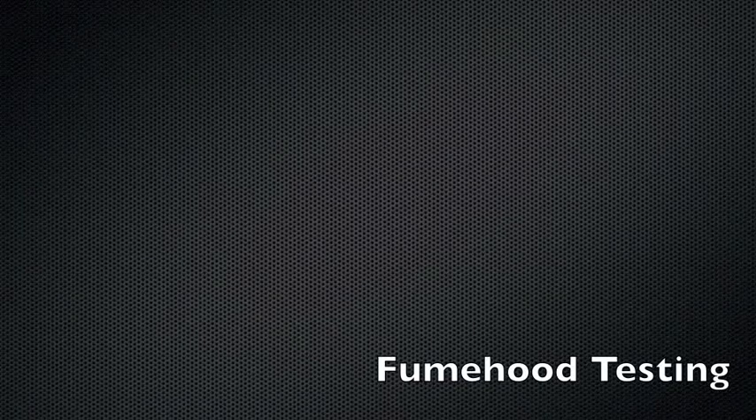This video will take you through the process of testing a fume hood to determine if it is safe for use and working properly.